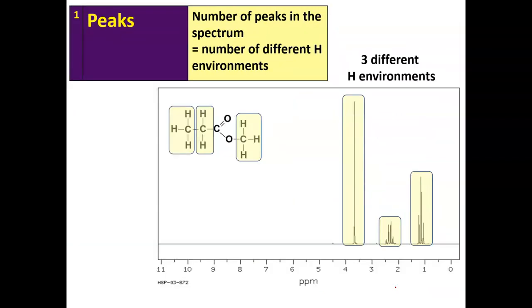Well, clearly that's very simple because we're familiar with the idea, and I've shaded them in yellow. And you can see on the structure of the molecule, there are also 3 different hydrogen environments. Let's just remind ourselves what that means. The methyl group on the far left of the compound, this one. This methyl group obviously consists of 3 hydrogens bonding to a carbon, which itself is bonding to more hydrocarbon.